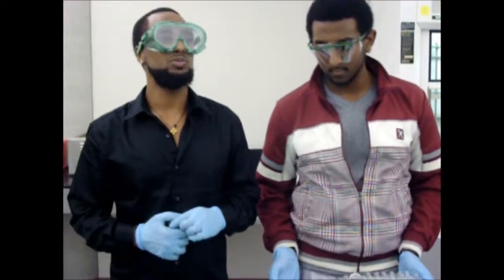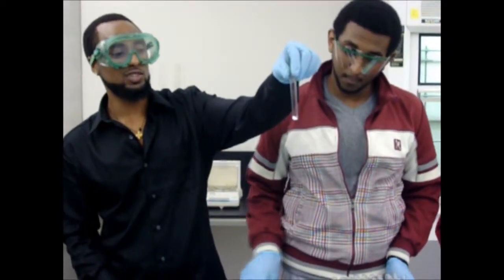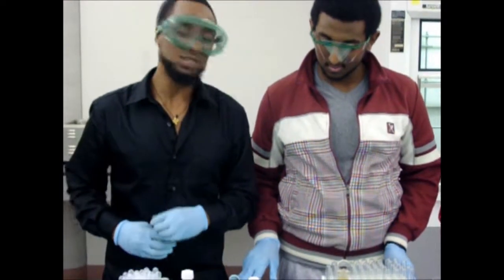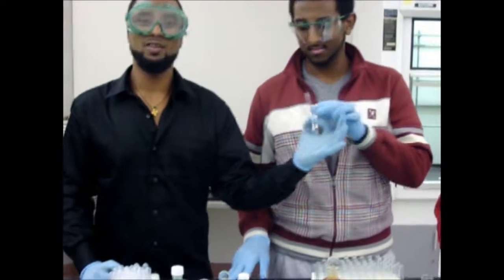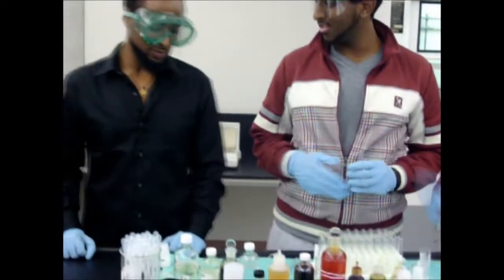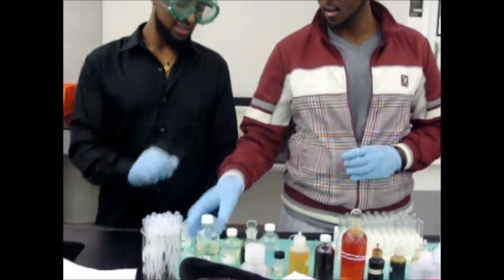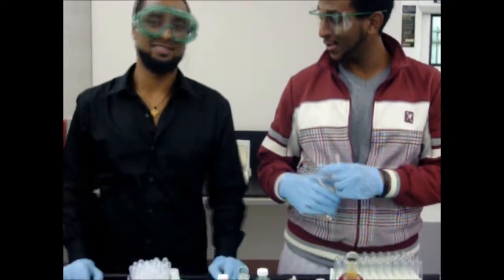So, what I did to prepare for this test is add some Lidocaine in our test tube. Now, if my partner would be so kind to put some Lucas reagent in our test tube, we could further proceed with our test. So, where's the Lucas reagent? It's right here. It is labeled Lucas reagent. Thank you so much.